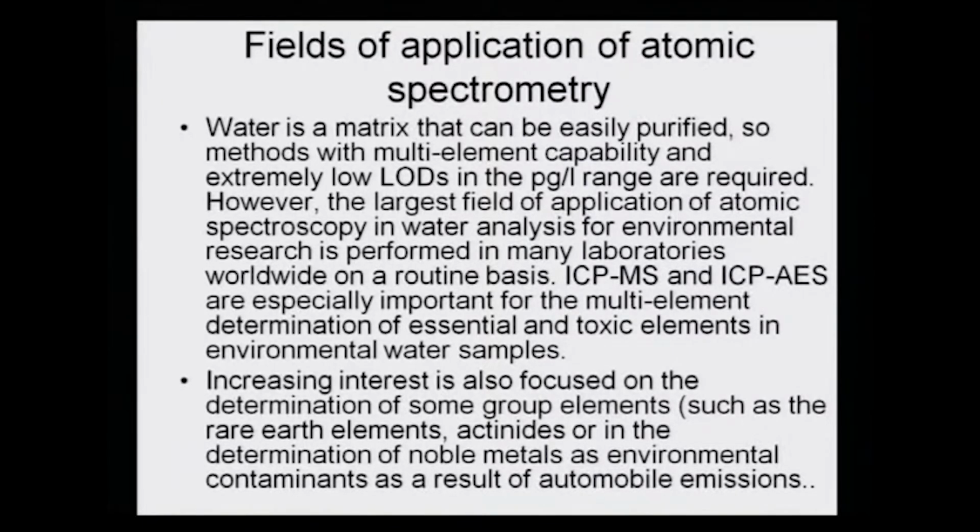So, the most complex samples are the environmental samples, because they can have any kind of contaminant. It is not only metal, but metal matrix complication and metal, non-metal also can create further contamination. Now, in such a big complex matrix, to be able to specifically analyze is a big challenge.